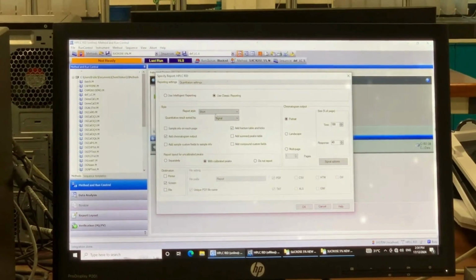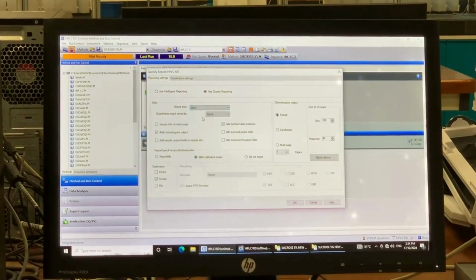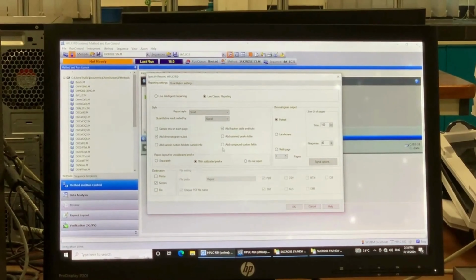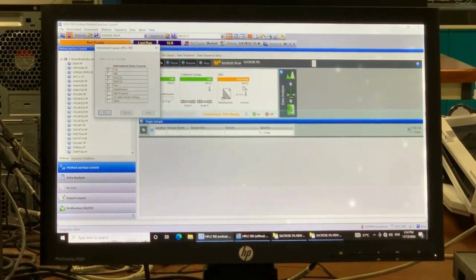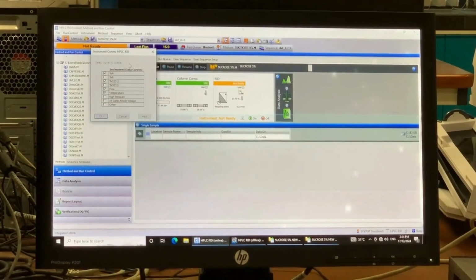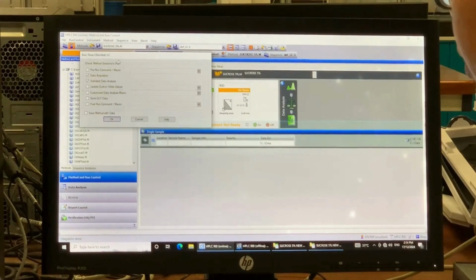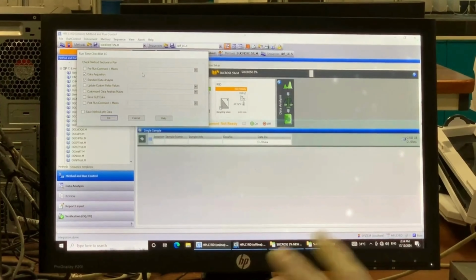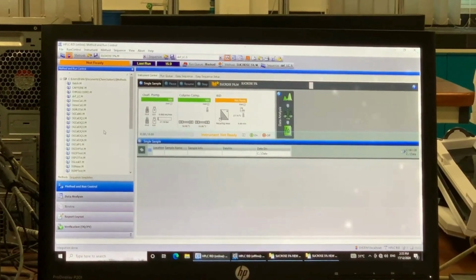On the report style box, choose Short and click on what boxes are needed in the report. So here we need chromatogram output and the fraction table and then click OK. Instrument curves HPLC RID page will pop up showing the boxes that are checked. That is what will appear in the report data, so just click OK. The runtime checklist page will pop up and do the same thing. Just click OK since there is nothing to change.